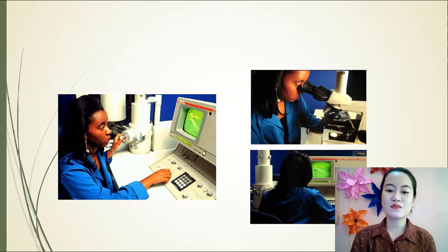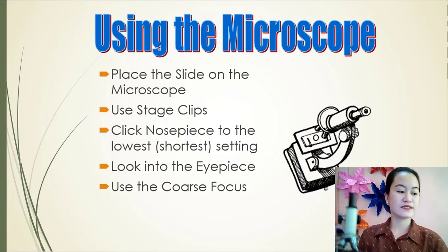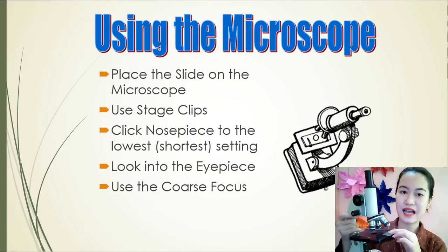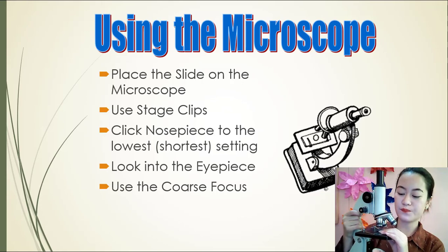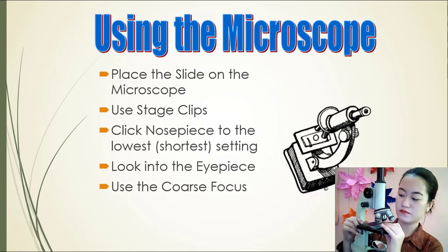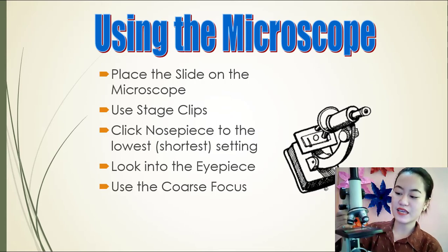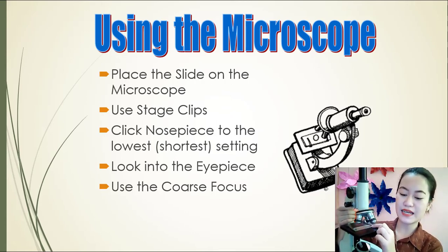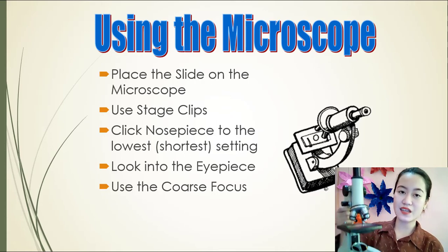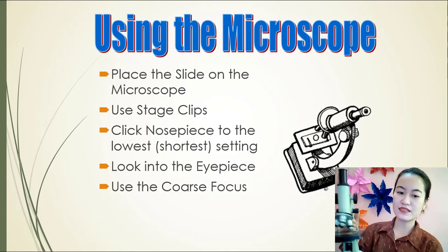Okay, so using the microscope. Okay, place the slide on the microscope. So we need to place the slide on the microscope. Okay, so i-clip natin siya. Okay, nagawa na natin. Next, use the stage clips. Okay, where's the stage clip? Ito. Okay, we are done.